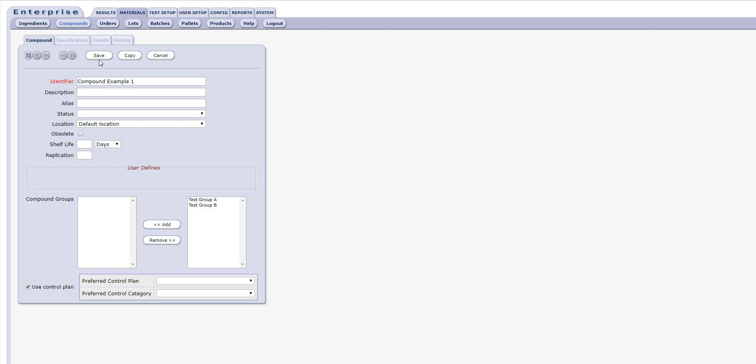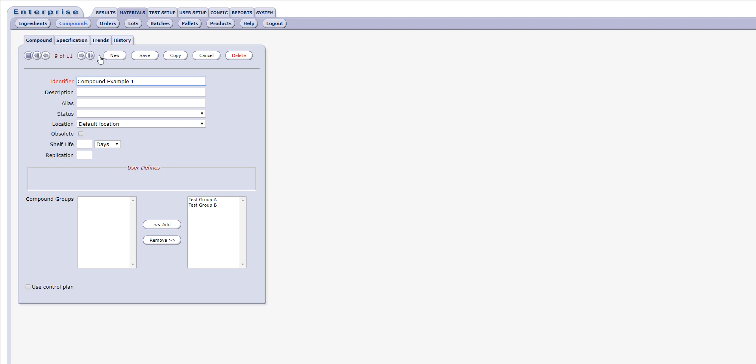This is the only step necessary to create a compound record, however, it is likely that you will need or want to enter additional information on the main compound tab. Note also that the name field is marked in red, denoting that this is a required field.